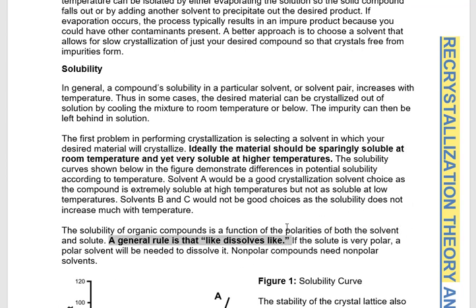So what are typically good solvents? You want to think about polarities. As a general rule, like dissolves like. So really what you're saying here is polar molecules will readily dissolve in a polar solvent. Water, for example, is a highly polar solvent. Salts, which we don't really call polar molecules, are ionically charged.